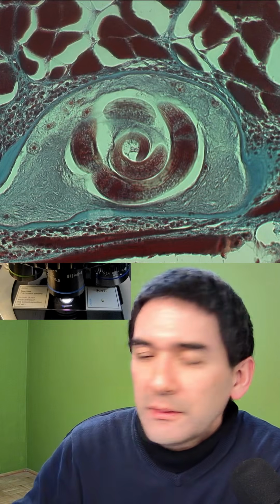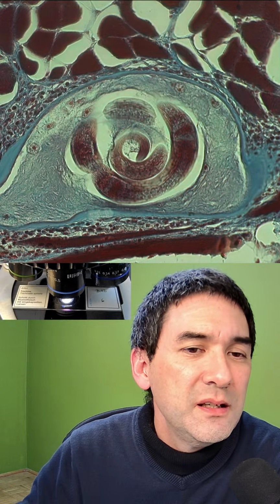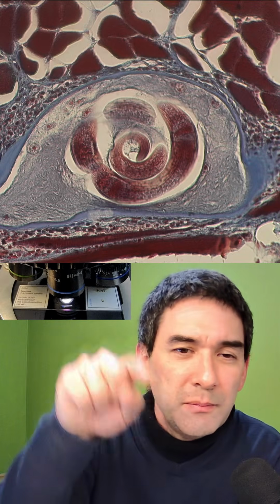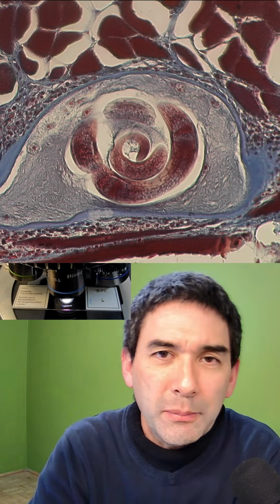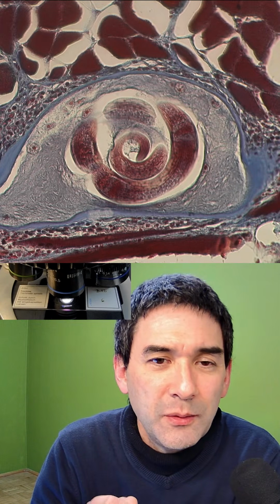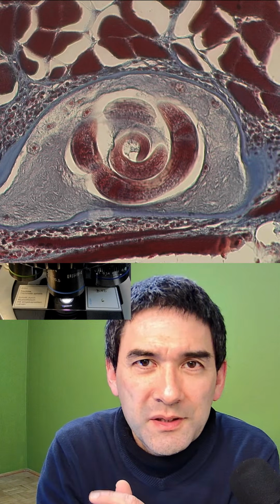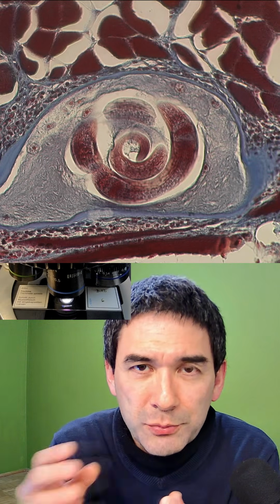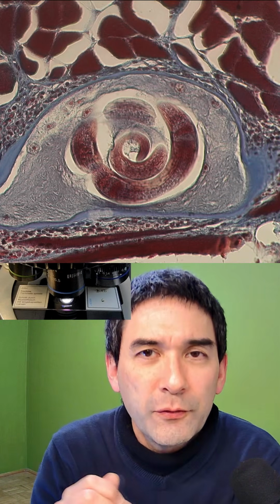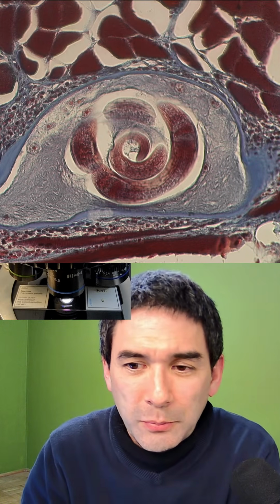Okay, so with the DIC, I'm a little bit limited here. What you see over here is this round thing. That's actually a worm that's spiraled up inside the muscle. So what happens is that when you eat contaminated meat, those worms will spread over the blood, and then go into your muscle, and they make those cysts in there. If you've got a lot of those, then this can actually be a problem. Then you can't move properly anymore.